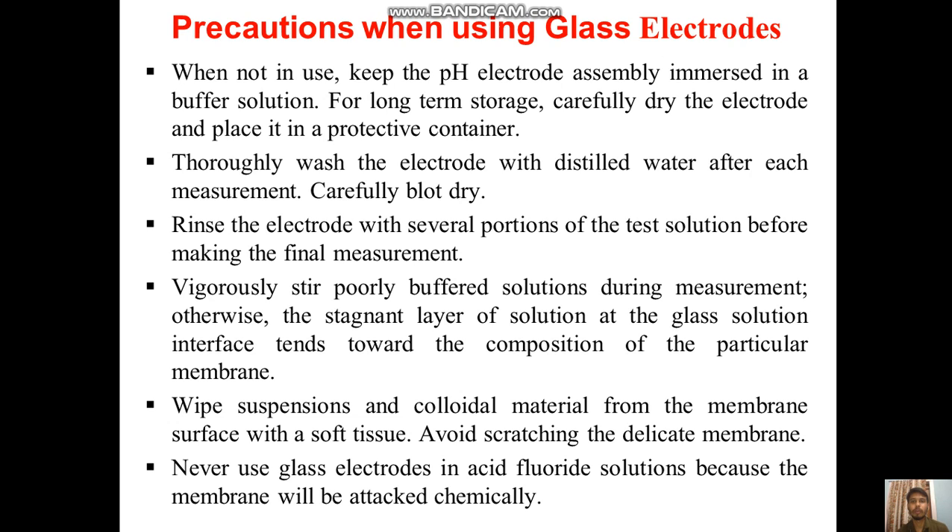So the precautions we need to take when using glass electrodes: when not in use, keep the pH electrode assembly immersed in a buffer solution. For long-term storage, carefully dry the electrode and place it in a protective container. Thoroughly wash the electrode with distilled water after each measurement and carefully blot dry.